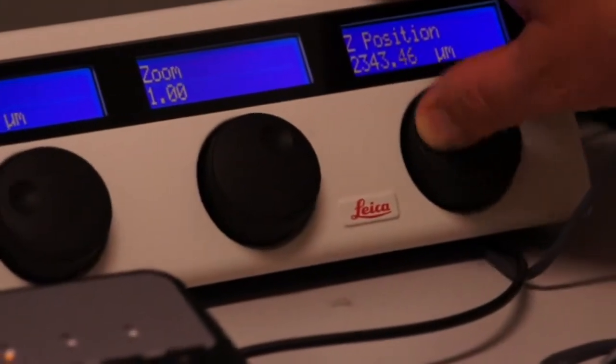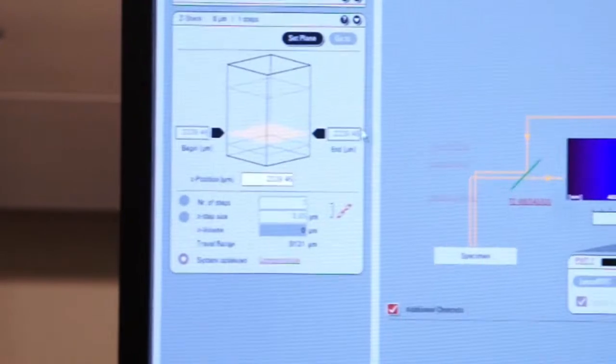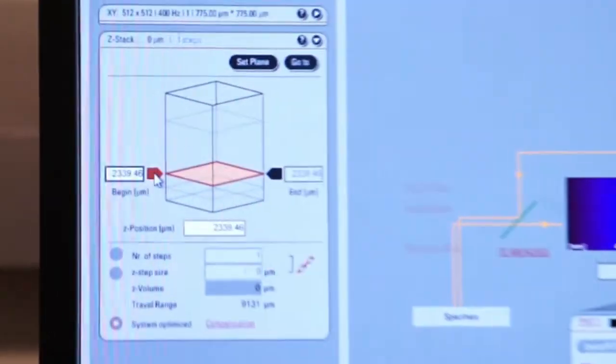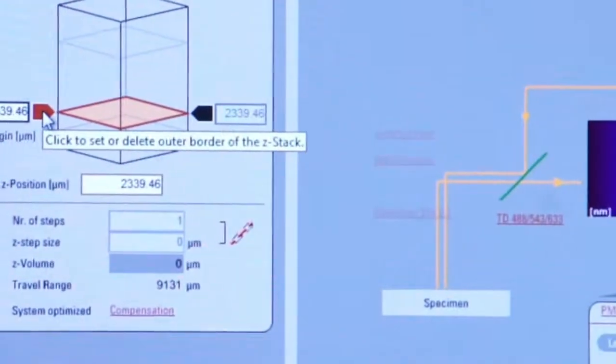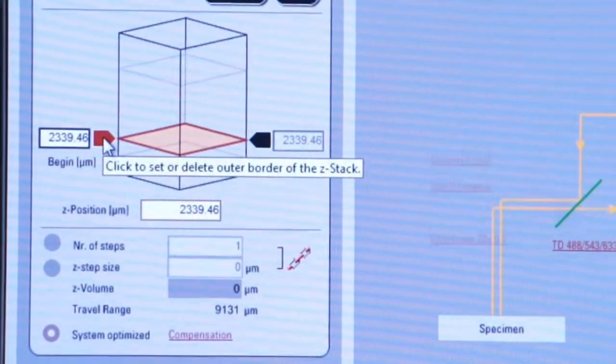And now I'm going to manipulate the Z-position knob on the smart bar to select the point that's out of focus, beyond the focus, underneath where I want to begin. That looks like a good position to begin. So we'll come over back to the Z-Stack. We'll click on the black arrowhead for begin, and we'll tell the system that is where we're going to begin our Z-Stack.